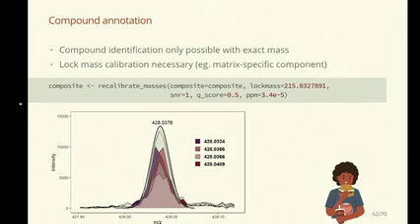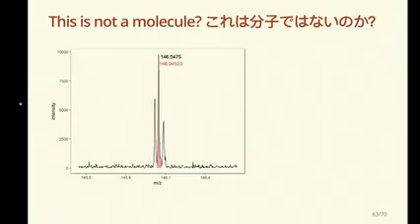I won't show it here, but we've also been able to quantify in the yeast data sets about 1,000 features, with the isotopic features as well, with adducts as well, and we can really narrow it down to only, let's say, a handful of different options per annotation or per compound, a lot of which are chemical isomers.